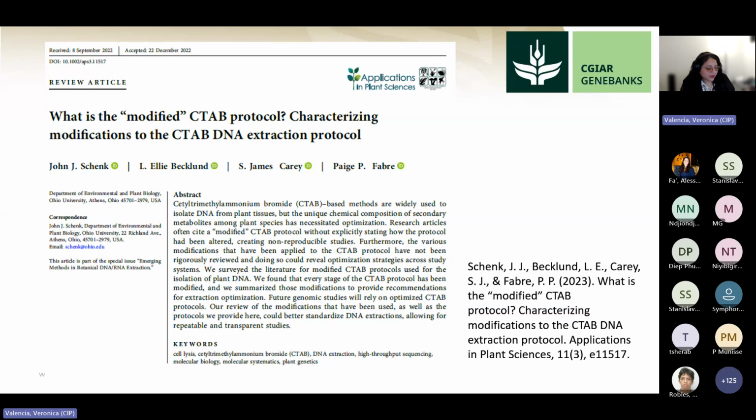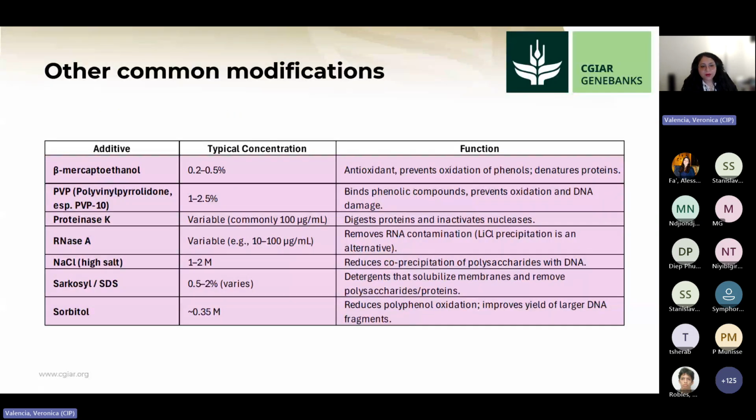It's a good article. What I liked the most was the other common modifications, like adding mercaptoethanol or polyvinyl or proteinase K, RNase A, etc.